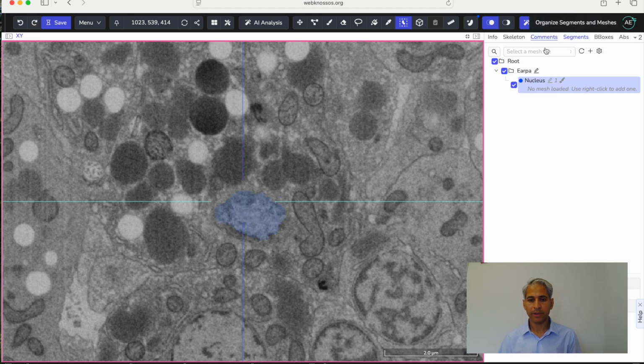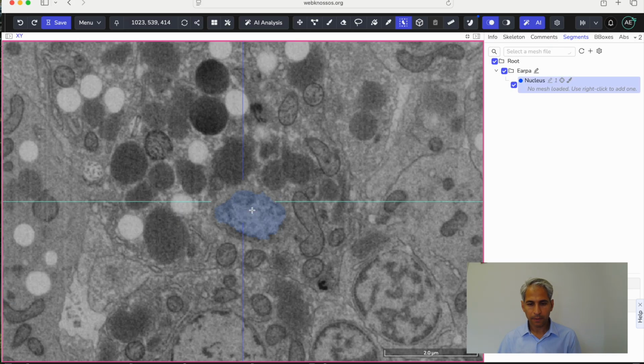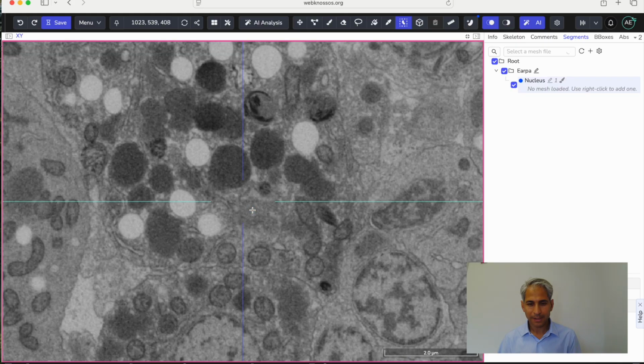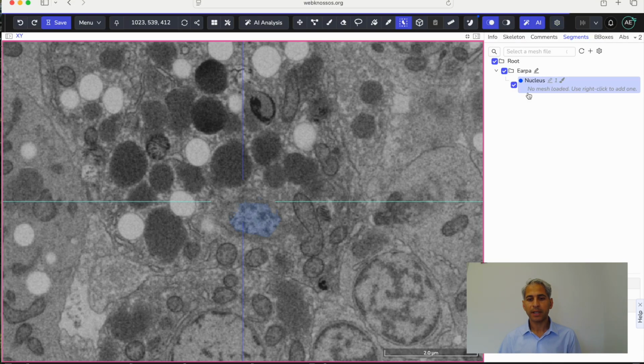Now I think I can do better than that. Let me do one more. Here we go, very beginning of the nucleus. I see it, I see it. Come on. Here we go. Let's take this one as the very other end of the nucleus.